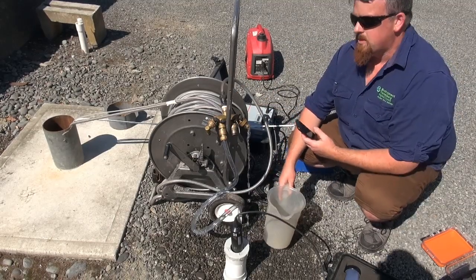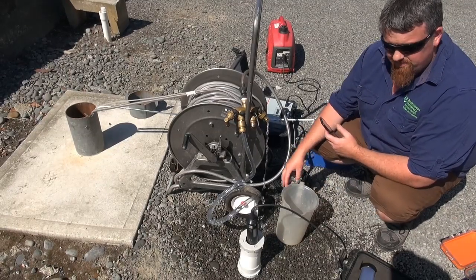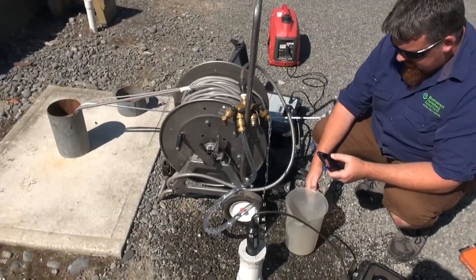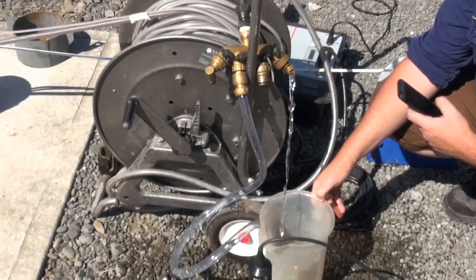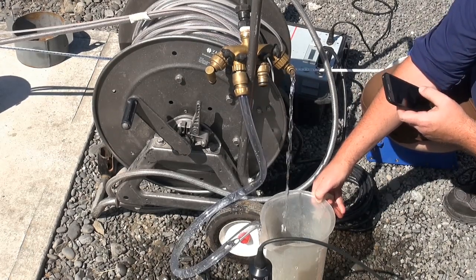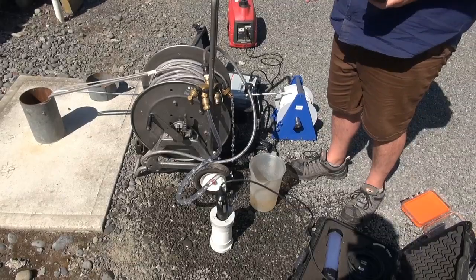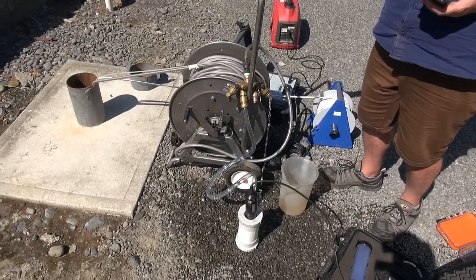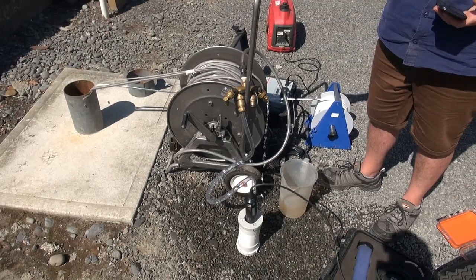So now we're going to record the flow rate so we can calculate how long we need to pump it before recording our manual field measurements throughout the purge. You just go start. Whether you fill a 5 litre or 10 litre container doesn't really matter — we're going to 1 litre this time around. That's 23 seconds for 1 litre. We've got 18 litres in the drivetrain, so that's 414 seconds — 6.9 minutes, say 7 minutes.